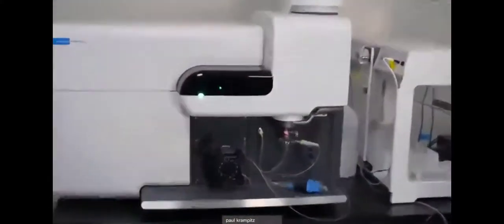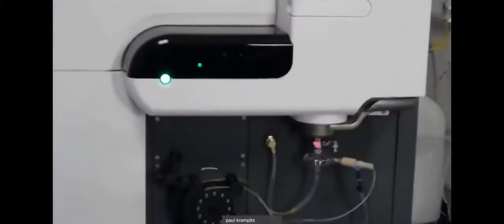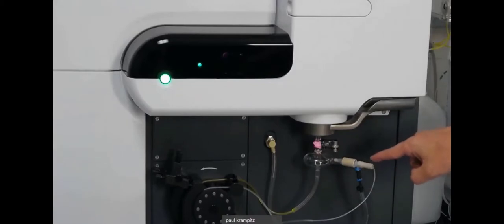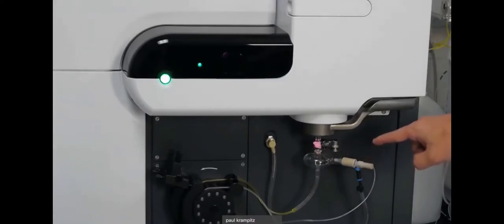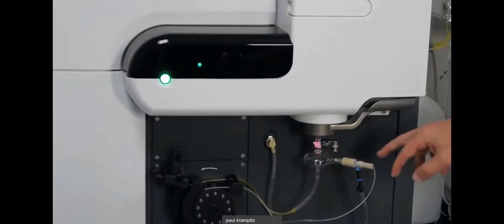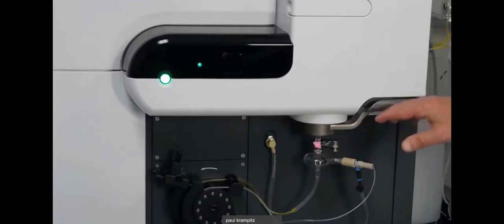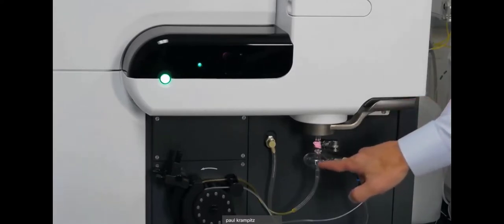And now you can get a close-up of the instrument itself. You can see the spray chamber right here, and the nebulizer. We're using a One Neb nebulizer. This is perfect for oils. It's a high total dissolved solid nebulizer, and it handles wear metals in oil extremely well. Your spray chamber is sitting right here.